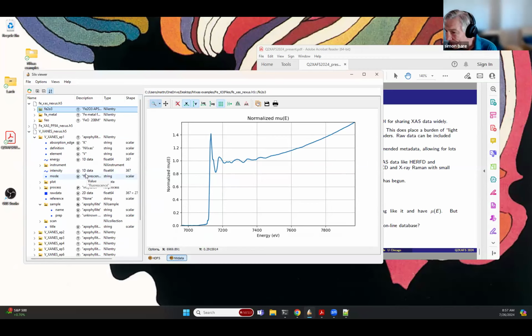Thanks, Adam. Let's see, what's this one? For the case of double or multiple edge XAFS fitting for one sample, much like an iron nickel alloy, can we use metadata set to achieve the constraint during the fitting because of two data for the same sample?